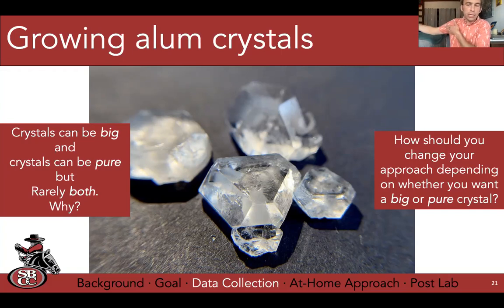But I told you don't get greedy. What do you think will happen if I went, because I can, super duper saturated? What do you think would happen to our crystal growth? Would it just instantly become alum? Yeah, we just have a giant hockey puck. So you can literally push the solubility so much that it just crystallizes into something without shape other than just the container. So that's literally by just pushing the solubility using those colligative properties, I can make a crystal hockey puck. So don't push the solubility too high.